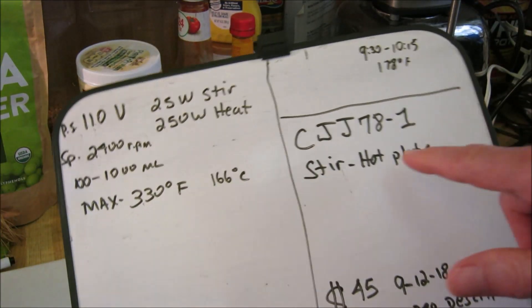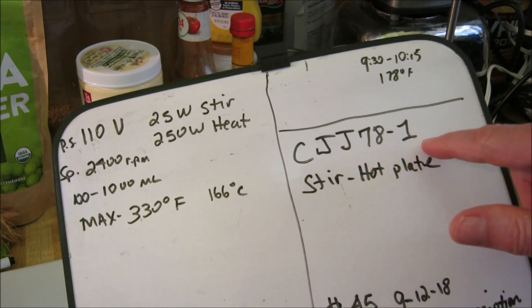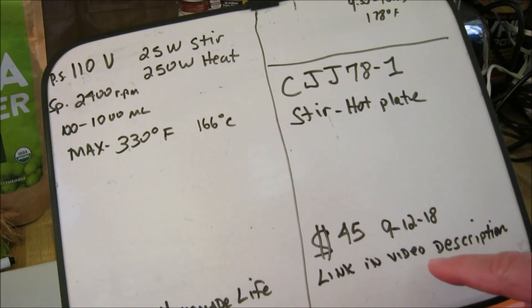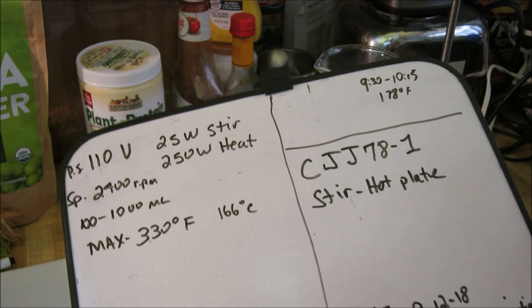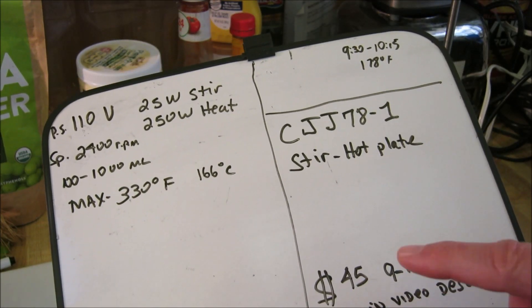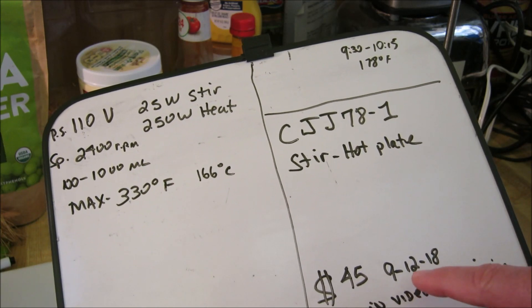This is the model, it's a CJJ78-1. I'll have a link to it in the video description on Amazon if you want to find out more information about it or buy it. It was about 45 bucks on this date, the 12th of September.